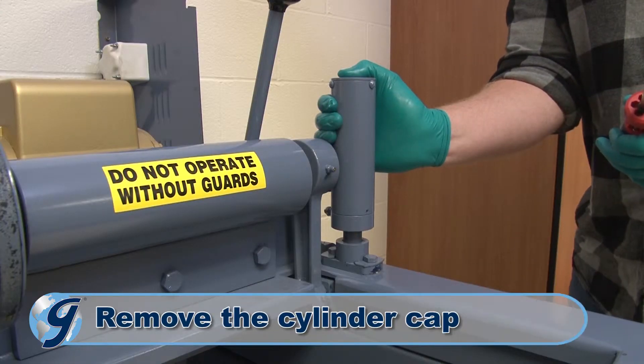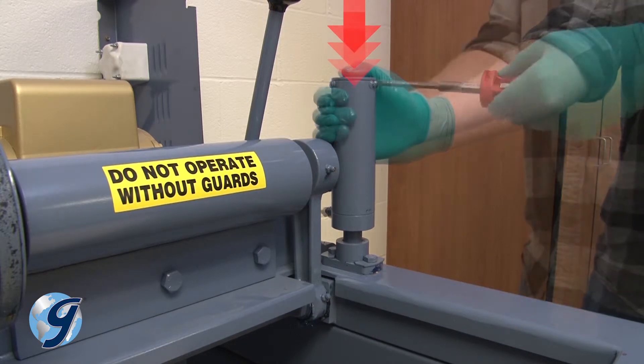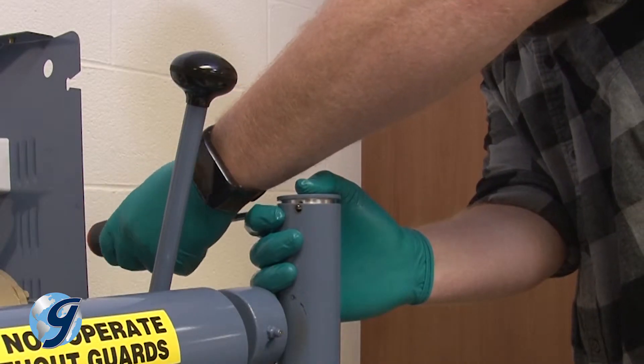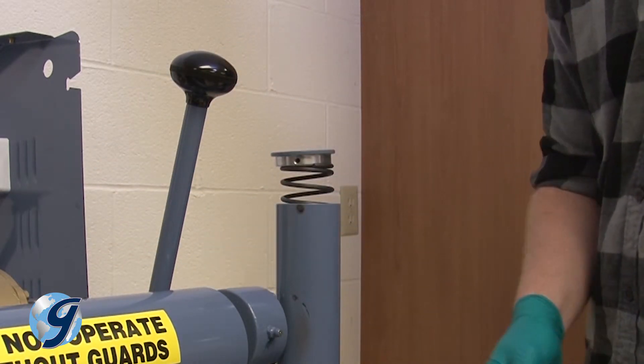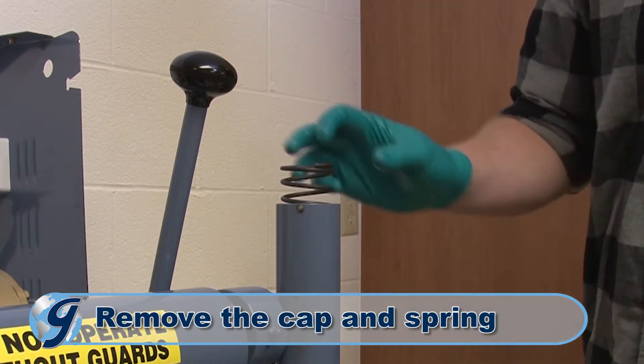Next, we're going to remove the cylinder cap. Keep pressure on the cap with your hand as you remove the three screws. Now, release the pressure of your hand slowly so the compressed spring does not suddenly pop out. Remove the cap and spring and safely set them aside.